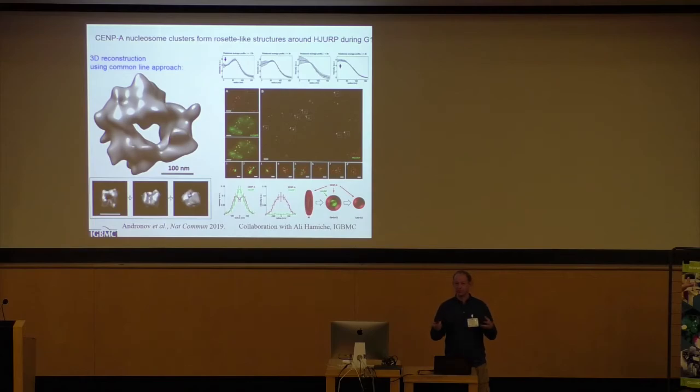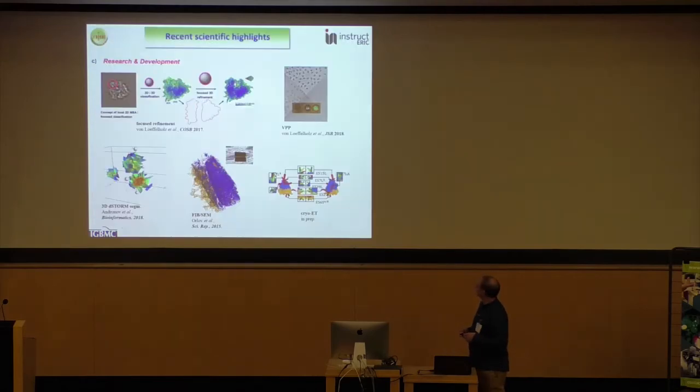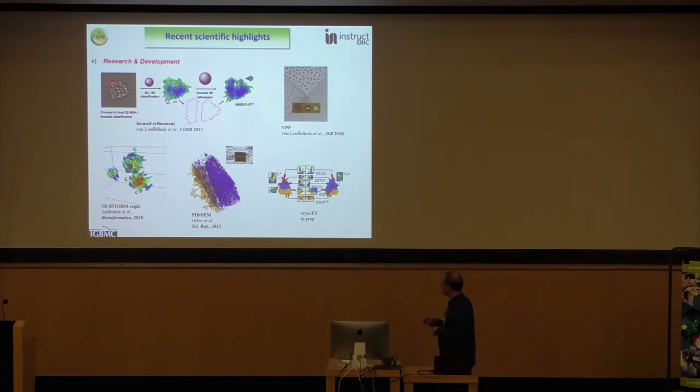And I think that is one of the points where the field can have a strong input in terms of developments. What we try to do here, for example, is developments around image processing, phase plate analysis, the super resolution microscopy applications, FIB. One of the most tricky things is certainly still to produce lamella and transfer them and then do tomography. This is by far not yet a pipeline, and a couple of places are doing that. We will see during the workshop what is actually being developed right now, and it's very exciting to see.